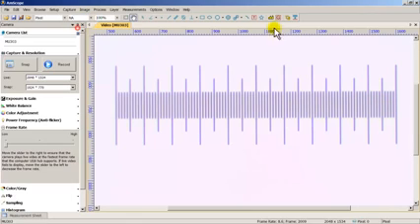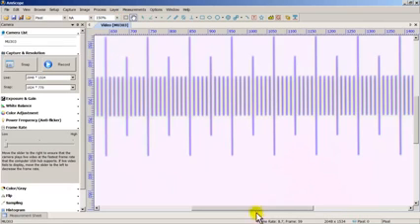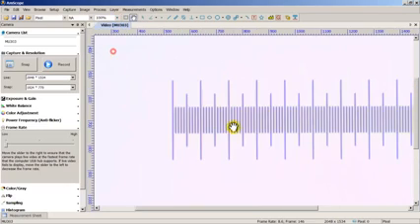Okay. So let's just see how that comes into play right now. So I'm going to go ahead and close this video, and I'm going to go ahead and reopen the camera. There it is again. There it reappears. I'm gonna go ahead and make the magnification like 150. All right, make it even more accurate. So I'm gonna go ahead and refocus this just to make sure it's clear. All right, let's try to go 100.